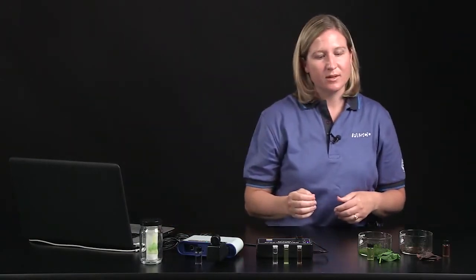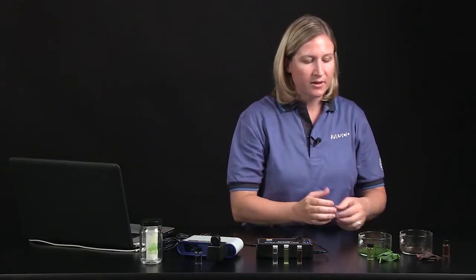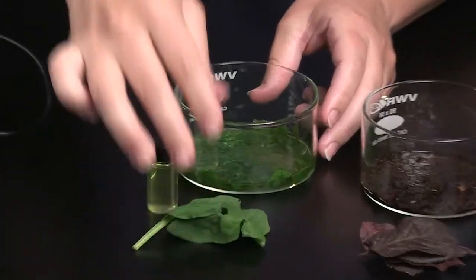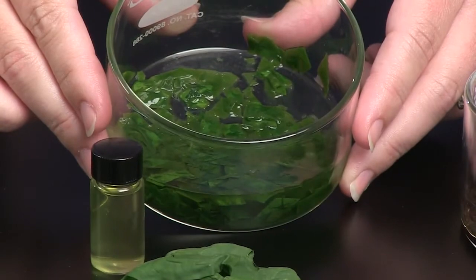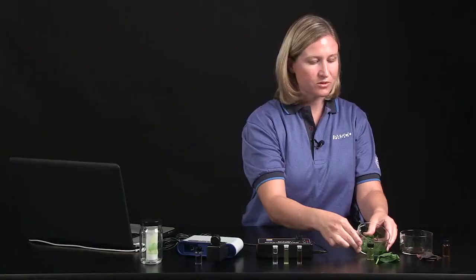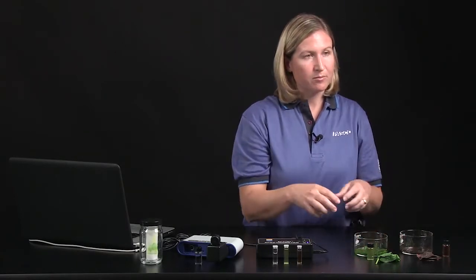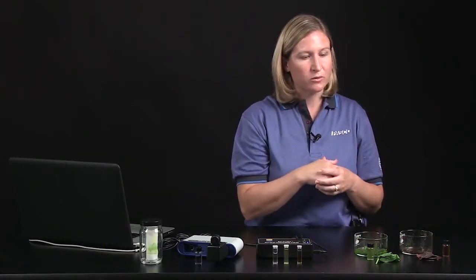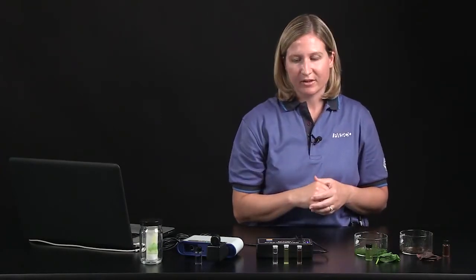To prepare the pigments for analysis with the spectrometer and the colorimeter, I took some leaves, chopped them into little pieces with some scissors, and soaked them in ethanol. You can also use a mortar and pestle to grind the leaves up further, and then push the extract through cheesecloth to get rid of the solid material, leaving you just with the liquid pigment extract. I've already set up a vial here with my spinach pigment extract.